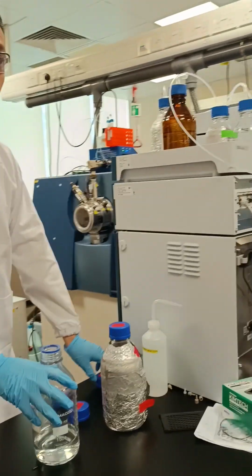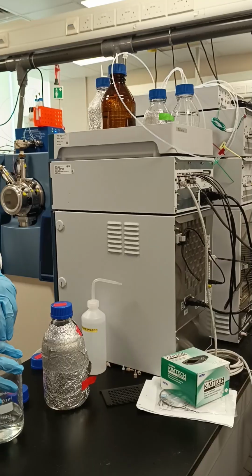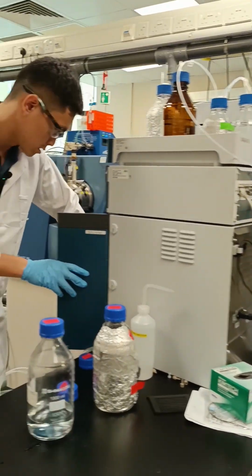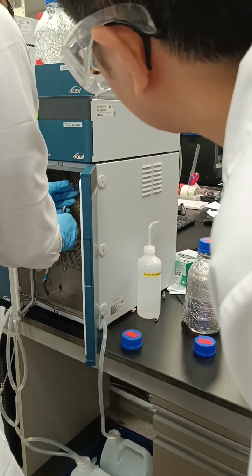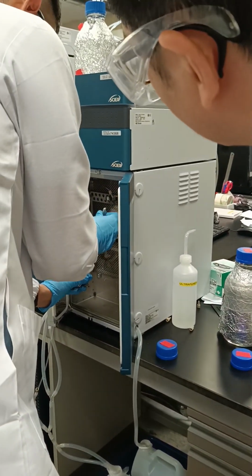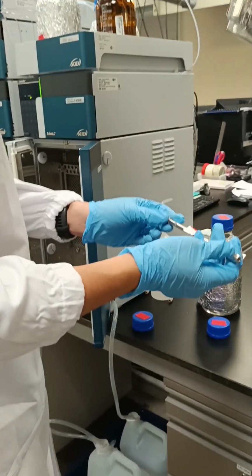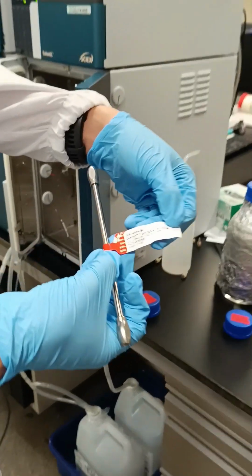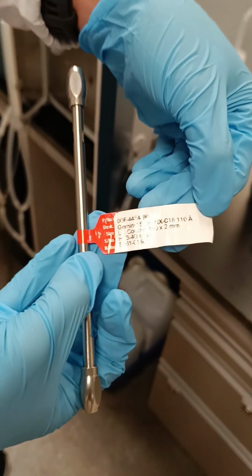Yes, it's a C18. I can show you guys. By right, when we do purging, we need to take the column out as well, but even if you leave it, it's fine. Just for your reference, I'll take it out first. This is just the normal HPLC. Just put it aside.